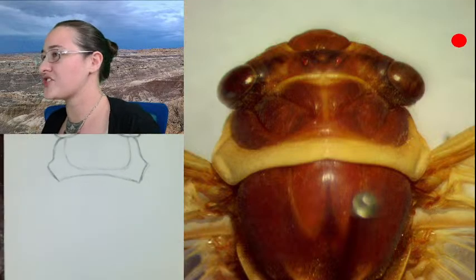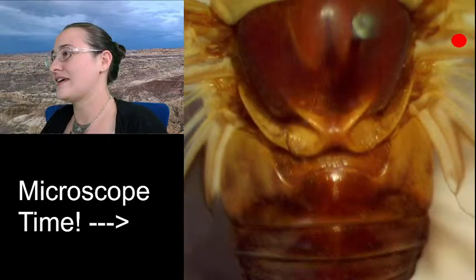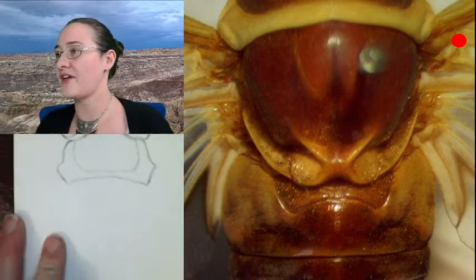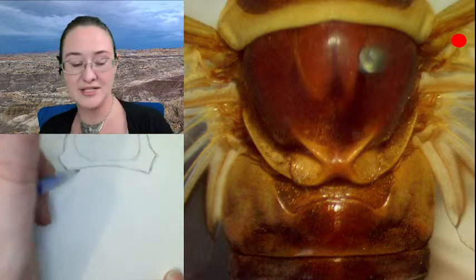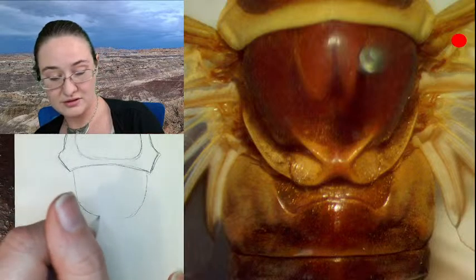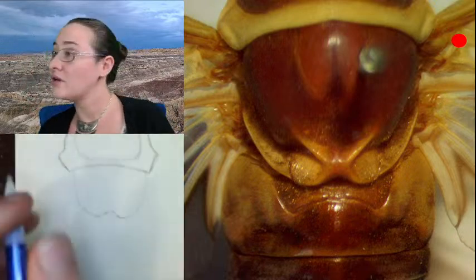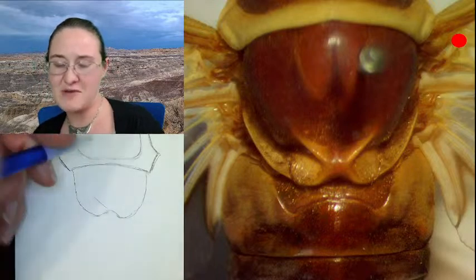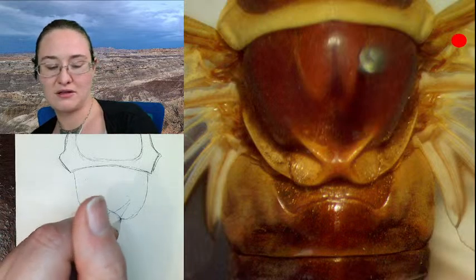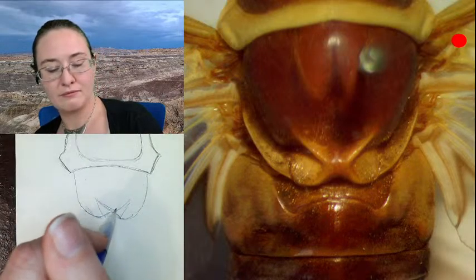Alright, I'm going to move our specimen back just a little bit so that we can see the rest of its thorax, and the start of the abdomen. Alright, got the head, we've got the pronotum. This is where our wings are all going to be connecting in, but we can always come back and give this large section. There we go. Some sculpturing down here in the bottom that's really interesting that I'm not exactly sure how to shade in. I'll admit that. There, something like this.